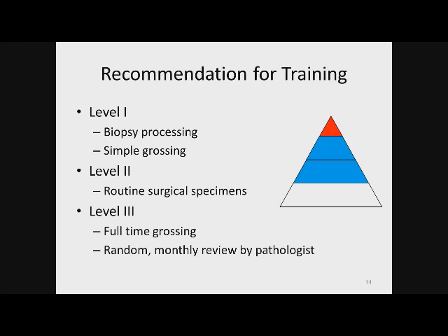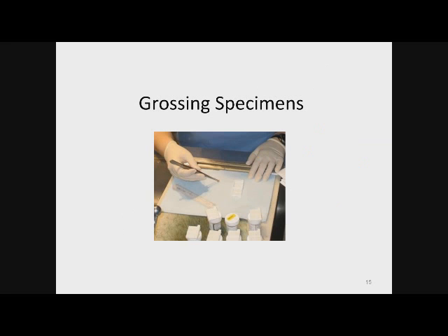So for the remainder of the seminar, I'd like to discuss some grossing principles. And again, this is not intended to be a training program for grossing, but rather introducing you to what grossing entails and to give you some guidelines, if you're thinking about having Histotechs gross in the future at your facility, on some things to think about when they're being trained for that procedure.